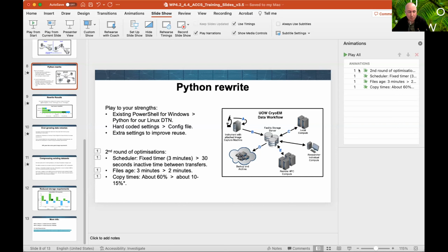Yeah, so that does depend a lot on the two endpoints and the network in between them. I can easily see 700 megabytes a second when I'm doing just an internal transfer between our file server and, for example, some of our different research groups who have a NAS, like a Synology NAS, and we'll send their data set to them to go and process themselves. A few of them have their own CryoSPARC on their own machines, and we'll get 700 megs a second across a 10 gig network link.